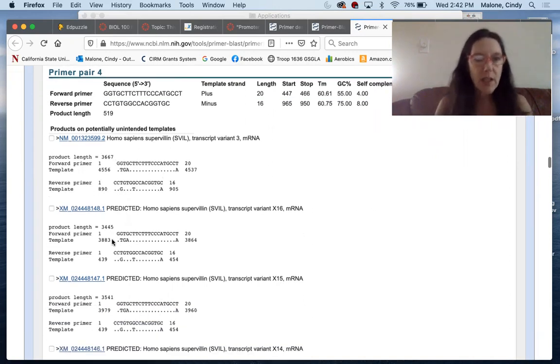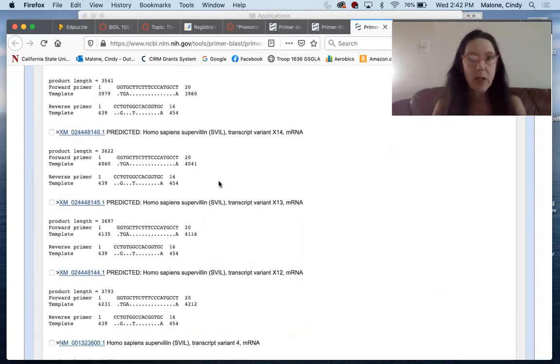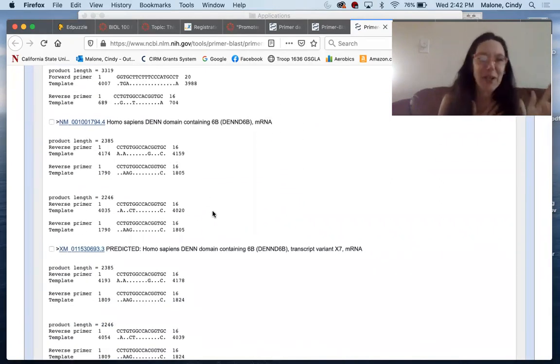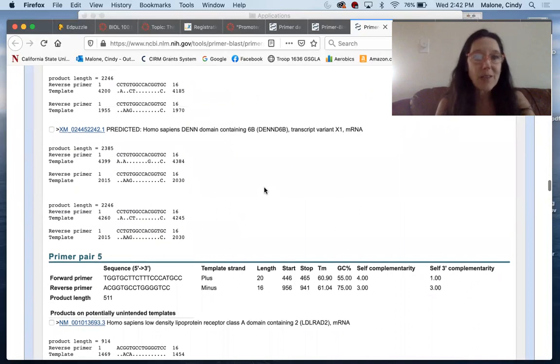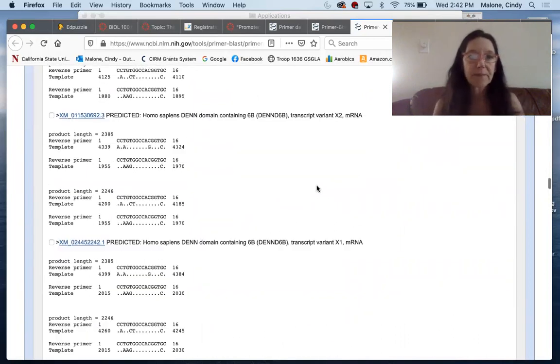This one's very large, 3,536. Super villain. It is a super villain. It's gonna suck up our primers. My primers. You guys don't have to worry about that. Another different gene, right? 2,300, still very large, not gonna get in our way. Okay, down to this guy. And then we move into that next primer pair. So we could say, okay, it's possible to sit on these. We know if we see sizes that big, not to panic.